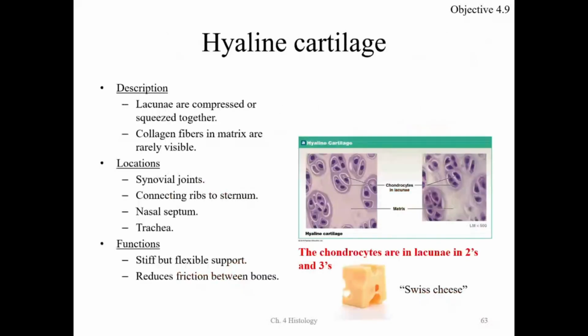All right, the hyaline cartilage. What are we going to do? Well, we have lacuna. Now, one of the things it says is lacuna get squeezed together. I'm going to say this is not entirely an easy way to learn it. Lacuna are compressed and squeezed together. Not my favorite description, but I like this better. Chondrocytes are in lacuna in 2s and 3s.